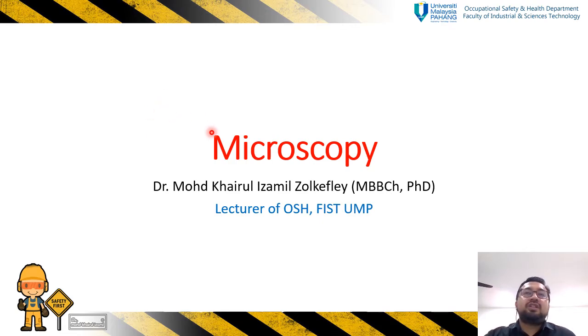So our topic today is about microscopy, which relates to the microscope. Actually, this topic is more to what we call factual, where you just need to know how it works, what the microscope is, and what types of microscopes there are.